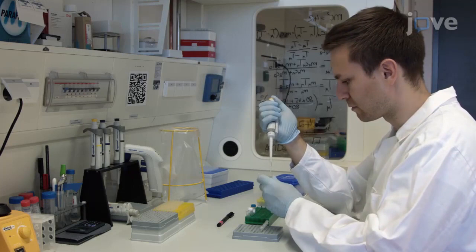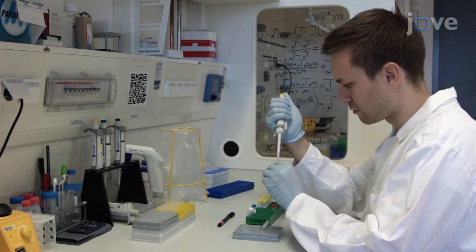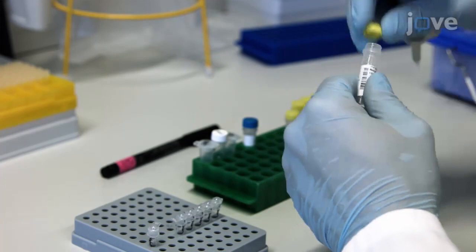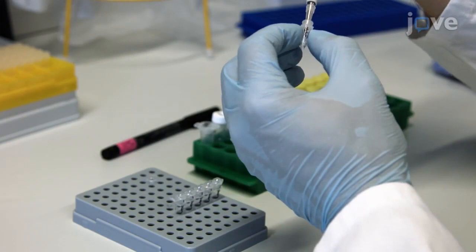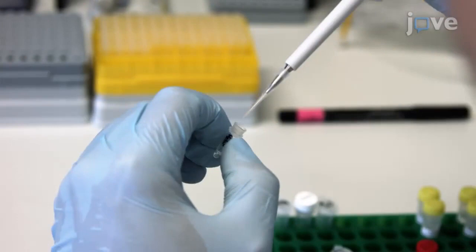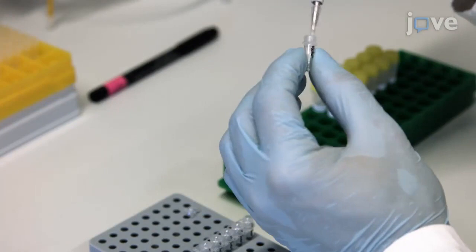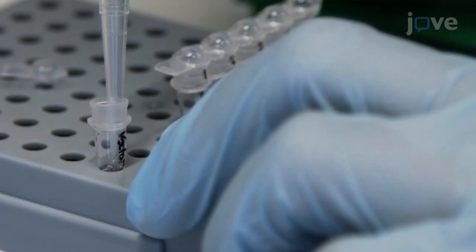To begin generating the individual cloning fragments for Gibson assembly, transfer 10 µL of high fidelity buffer to a tube. Add 1 µL of 10 millimolar dNTPs and 0.25 µL of both 100 µM overhang primers. Add 10 ng of the DNA template string or vector and 1.5 µL of DMSO. Add enough water to bring the final volume to 49.5 µL.